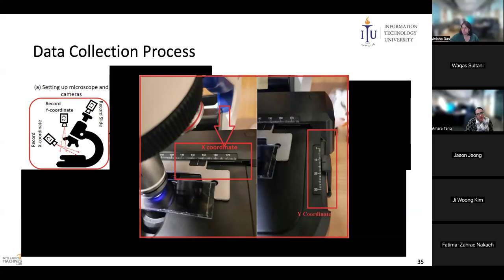For each image we have these coordinates, which means that even after 1 year, with the same slide, we can go to these coordinates and find exactly where that specific cell is. Actually, it should be at the same place, but if we want to get the image again, or want to see the locations, we actually capture the XY coordinates of the microscope. By the way, these coordinates actually vary from microscope to microscope because they are not 100% identical. They have their own calibration noise and all this stuff.